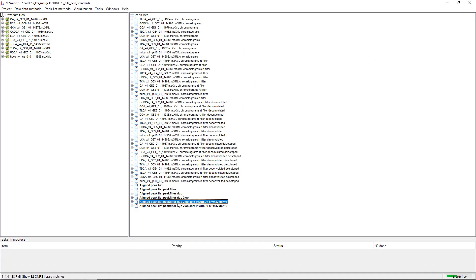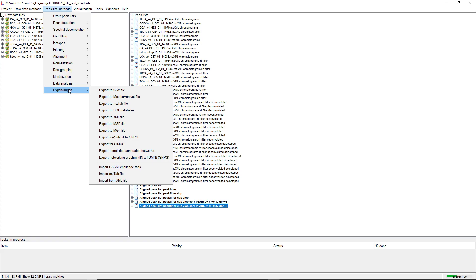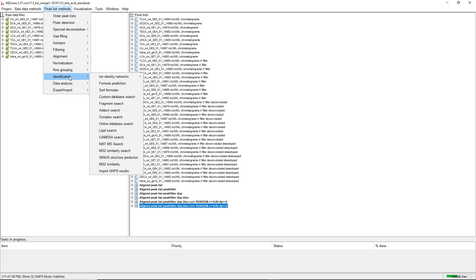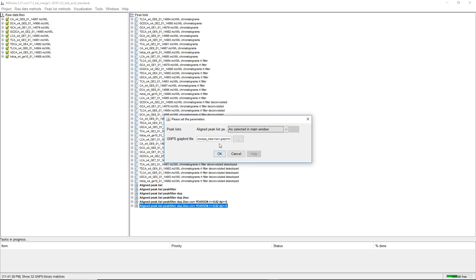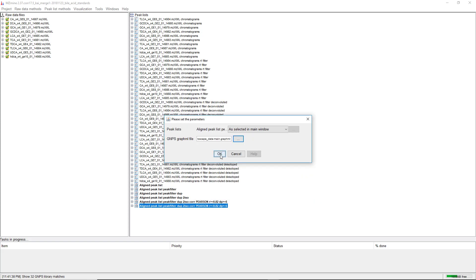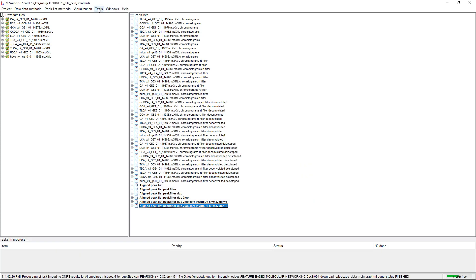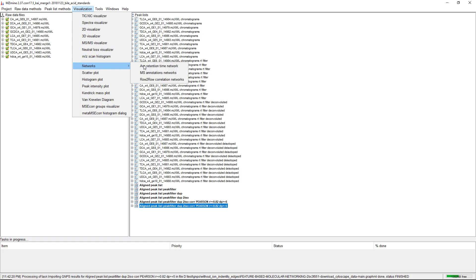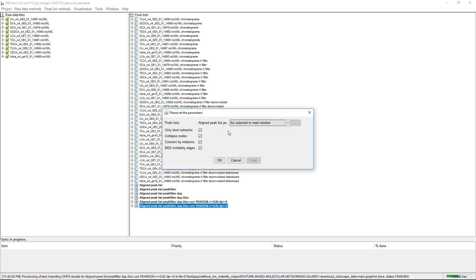But we did Ion Identity Networking, and so now we want to also visualize Ion Identity Networking together with feature-based molecular networking. For this, we go on Import GNPS Results again, take the same GraphML file, import the results, and then go on Visualize Annotation Networks.